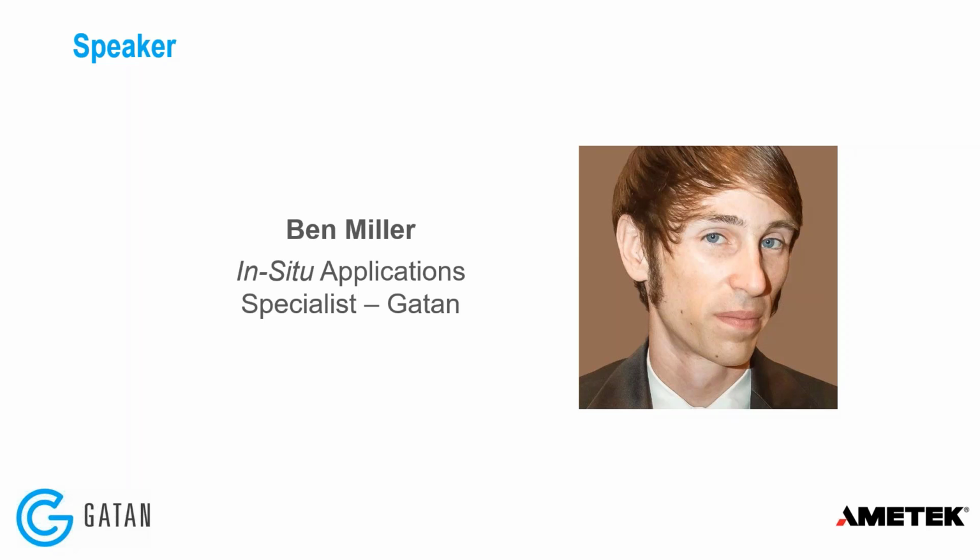In his role, Ben routinely helps customers to get the most out of the data they collect. And in the webinar today, Ben will share from his experience to describe the in-situ player within GMS to work with large in-situ datasets, give a live demonstration using two different datasets, and then conclude with examples of using Python scripting to augment the built-in tools.